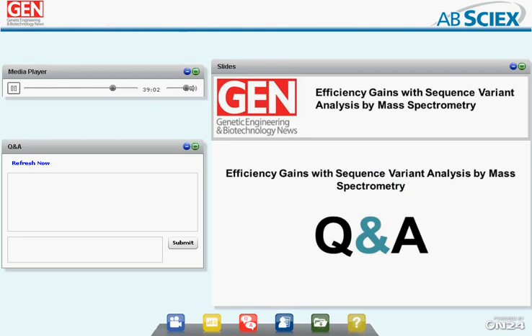The first question is, I've already got Mascot Server running in my lab. Can I teach it to do this kind of searching? Yes, a Mascot server as well. The newer versions do have an error-tolerant searching function, and there is a good paper by Vish Kata at Genentech showing how to implement those into your normal workflows.